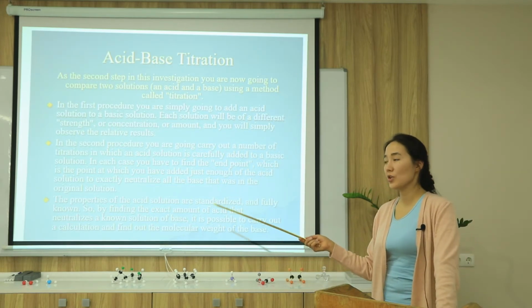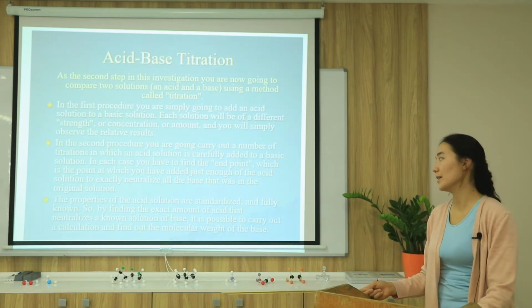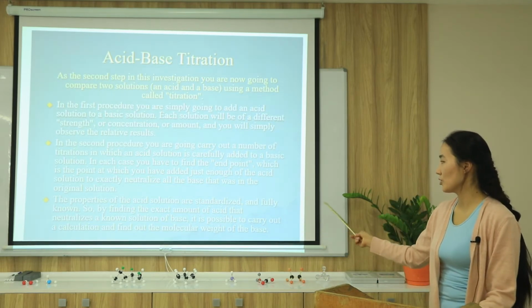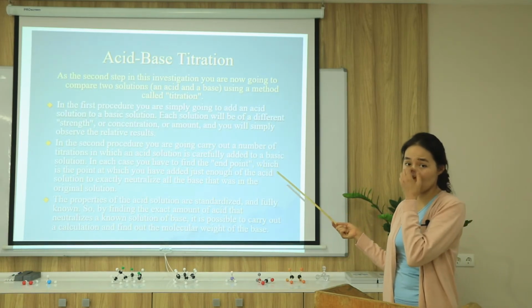The properties of the acid solution are standardized and fully known. By finding the exact amount of acid that neutralized a known solution of base, it is possible to carry out the calculation and find the result. This titration is a very easy one, first of all.